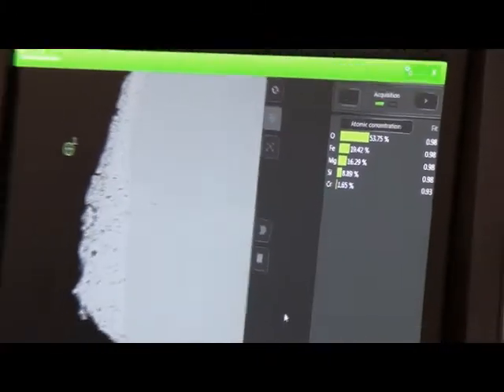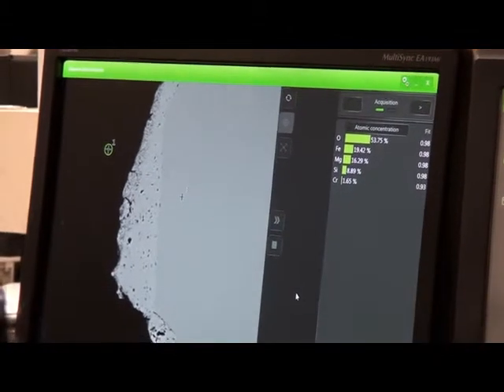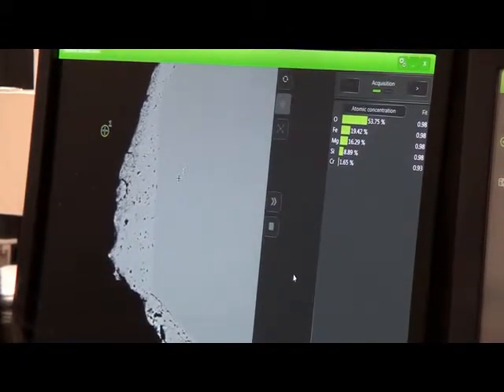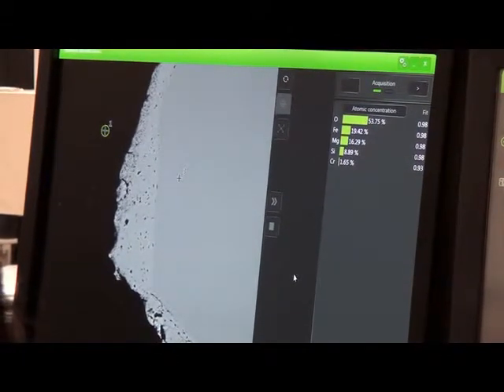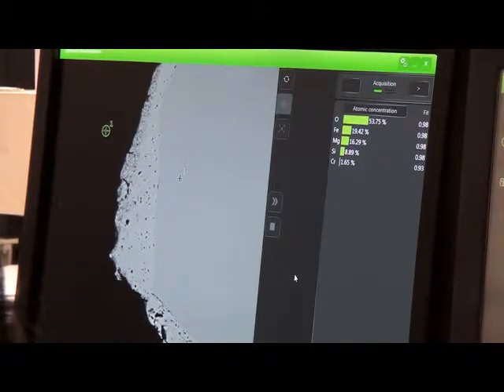Okay. When this initially formed, you would have had this oxide, rich in chromium, iron, and oxygen stable, sitting next to this silicate phase, most likely an olivine.